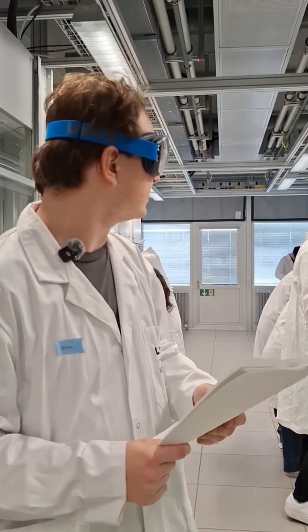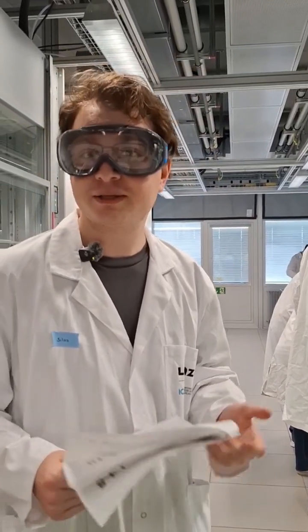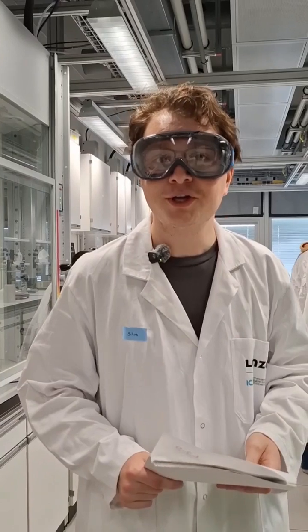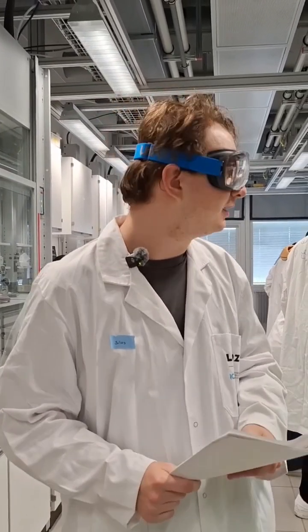The students today are challenged by something they've never done before in their lives, something they've never seen in chemistry before. So we're really excited to see them learning and making progress as chemists.